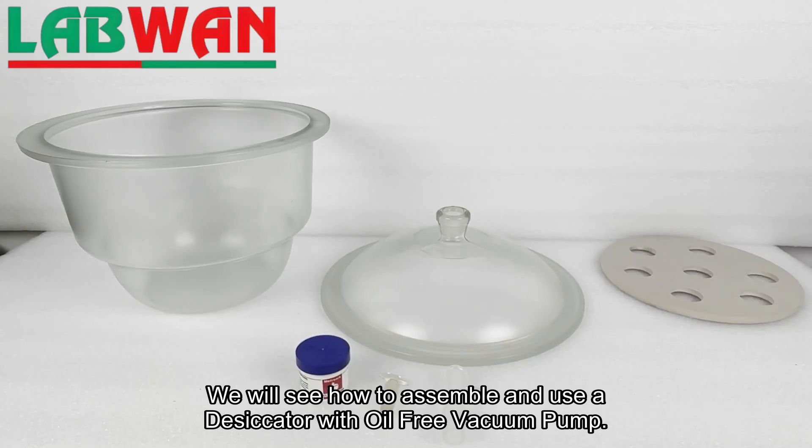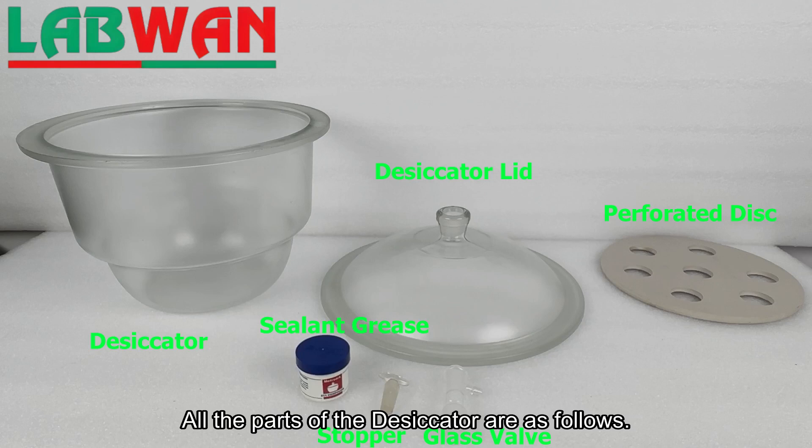We will see how to assemble and use a desiccator with an oil-free vacuum pump. All the parts of the desiccator are as follows.